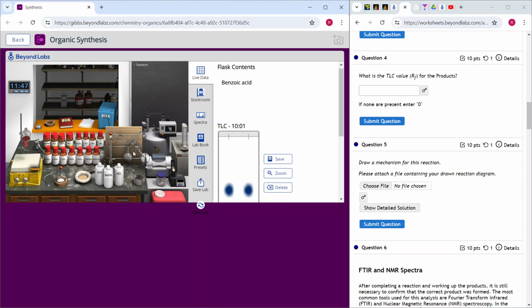All you need to do is bring that distillation all the way into this station, bring your flask into the distillation setup, turn on the heat, and monitor the temperature of the reaction, because one of the components will evaporate at a lower temperature, and whatever evaporates at a lower temperature needs to be your product that you would need to isolate. Okay, so here you go.